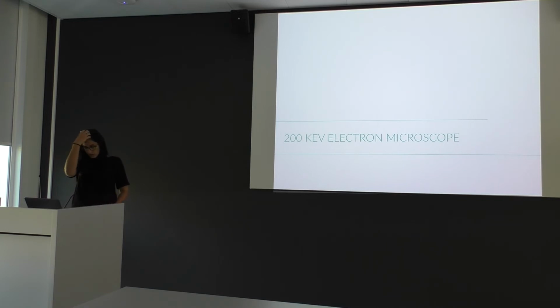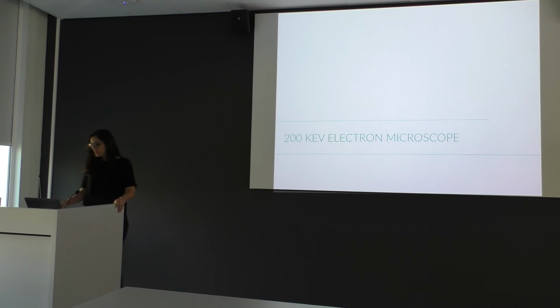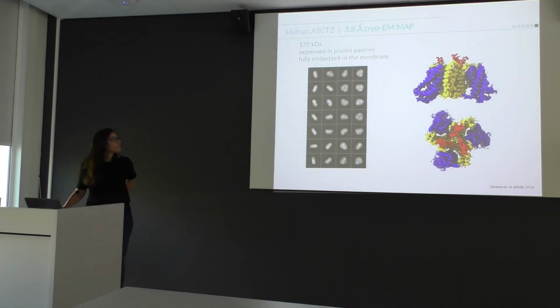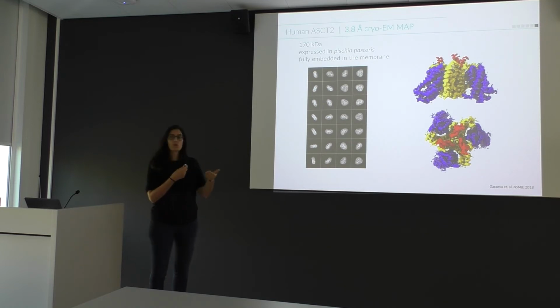Okay, so I had also promised to give a few slides on our use of the 200 kV machine in our house. Everything I showed you was done in-house on our Talos Arctica, and we have actually been quite successful, which made me really happy. We have been doing a couple of collaborations, and this has all been in-house. I just very briefly want to mention it to show the power of the machine.